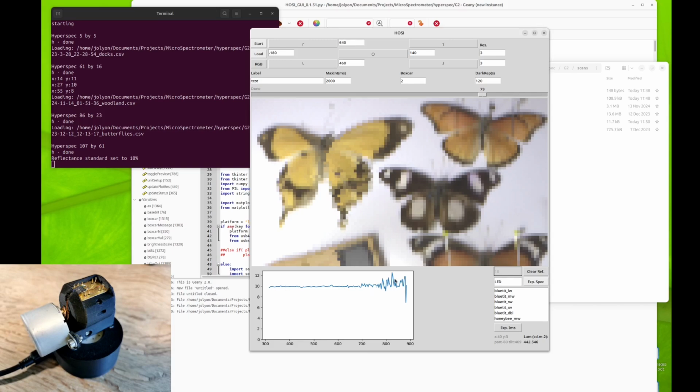Getting a bit noisy in the infrared where the light was giving off less reliable, very spiky infrared output.